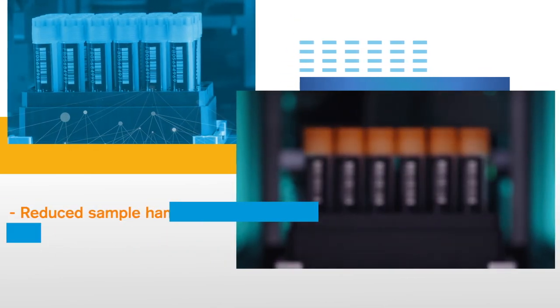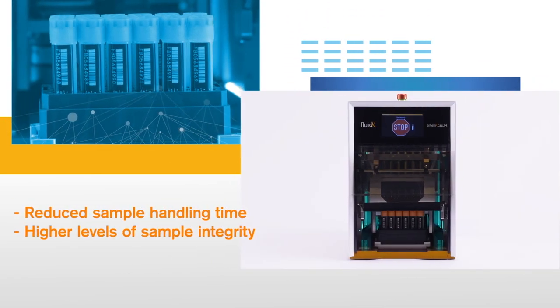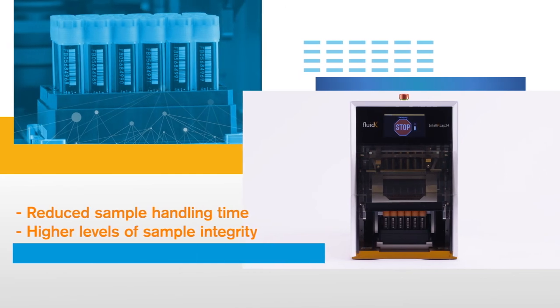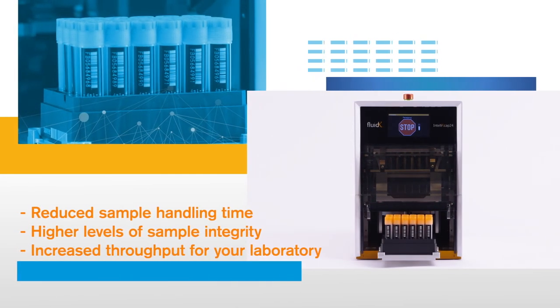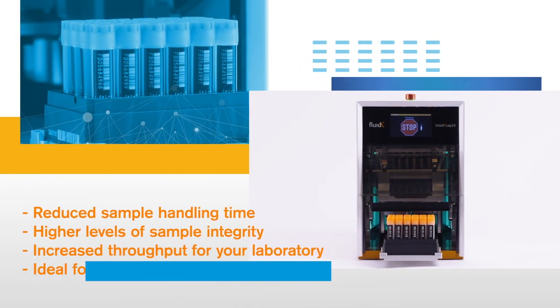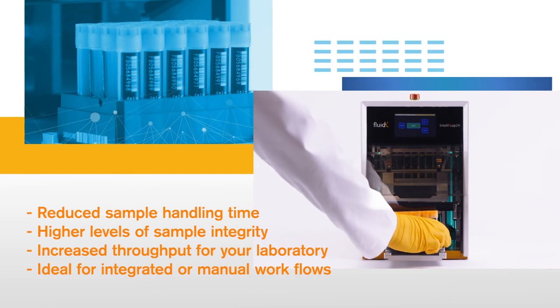Reduced sample handling time, higher levels of sample integrity, and increased throughput for your laboratory, ideal for integrated or manual workflows.